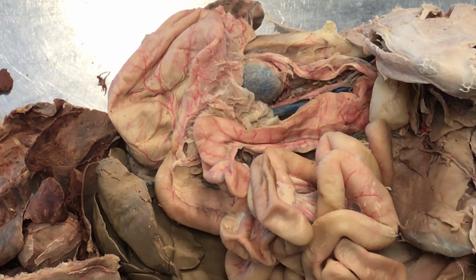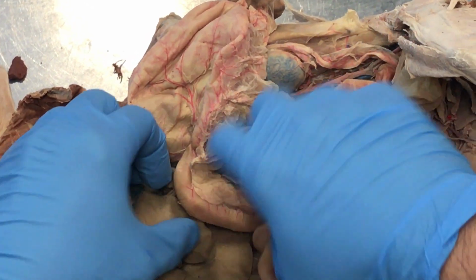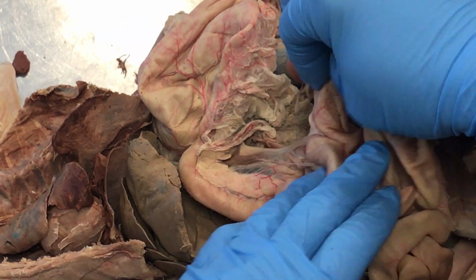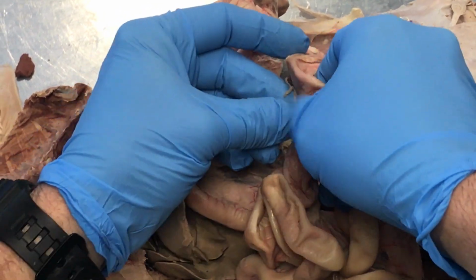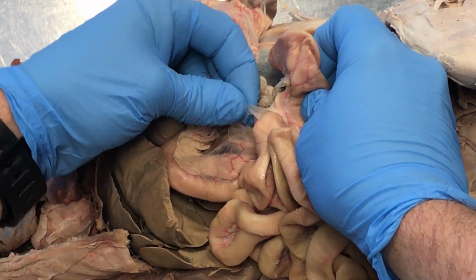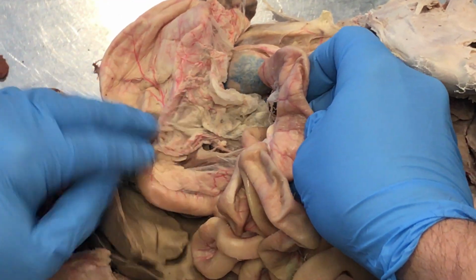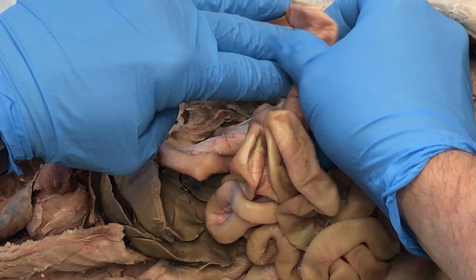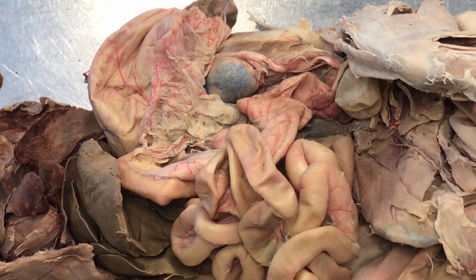Jejunum, all right. Mesentery, we covered that. Cecum, we covered that. Colon, ascending, transverse, descending, we covered that. Mesocolon. All right. So it's been cut here. Some of it's still kind of intact. So the transverse colon right here, this part of the mesentery goes back in this direction, and a little bit of it's still attached right there. This is what we would call transverse mesocolon. It goes back towards the pancreas. So this is a little bit of it still intact, but that membrane, that sheet, would have gone all the way back like this, back towards the pancreas. So that'd be transverse mesocolon or mesocolon.